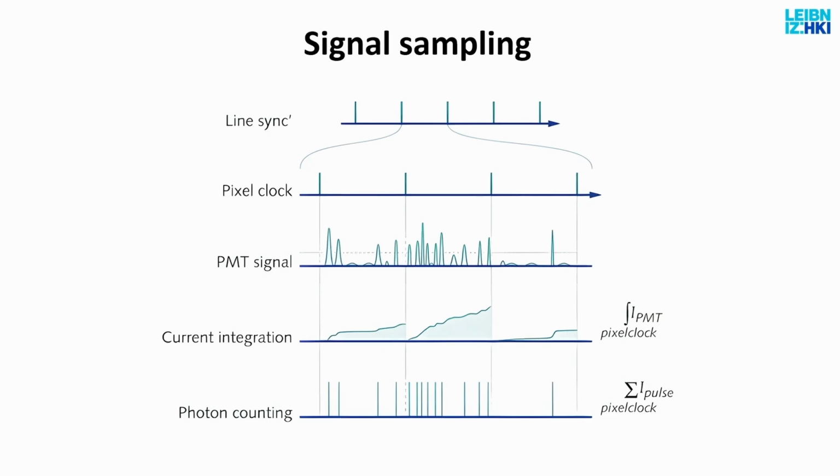And then from the detector, you just get a continuous current coming out as the electrons arrive at the detector part. And we sample, so this is what the sample actually looks like. If you ever look at an oscilloscope, that's what it looks like. These are photons hitting the multiplier and then generating current. And then this is what a pixel is. I say, let's collect this direct current from the detector, from the photomultiplier, for 2 microseconds.